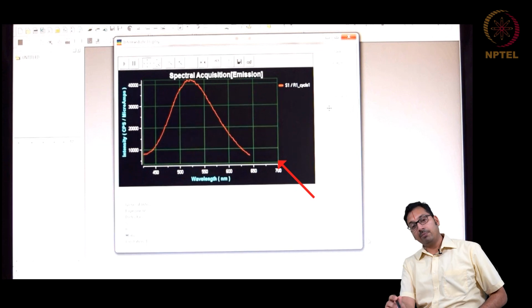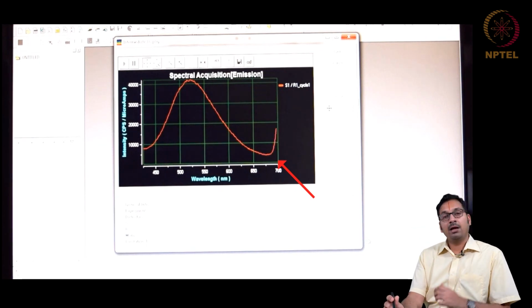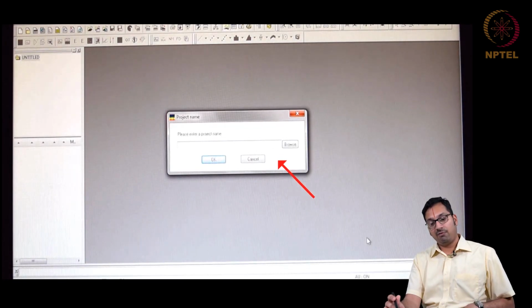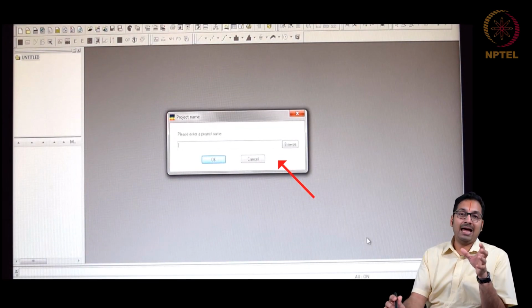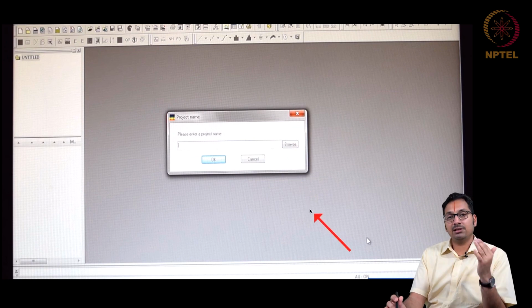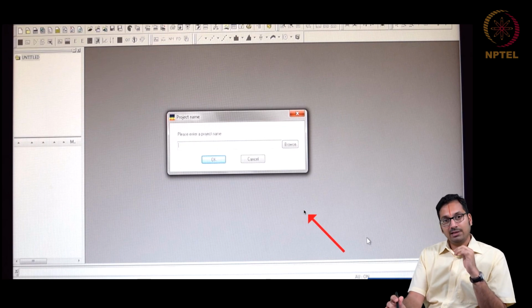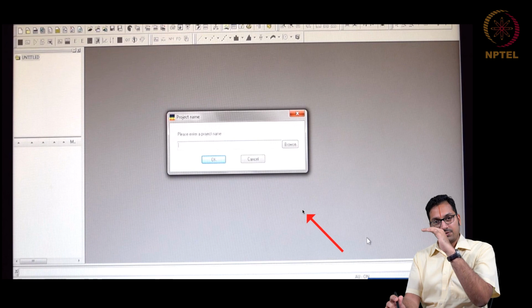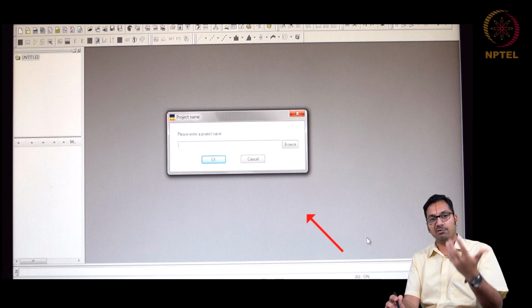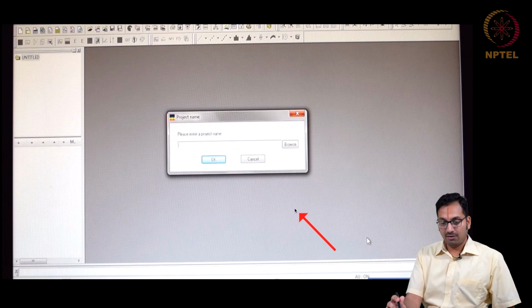If you might remember the last week's classes, what we ended up understanding there is that until the micelle is formed, you are not going to have the fluorescent dye that is trapped within this micelle, which will result in low fluorescence intensity. Basically the intensity maximum that you ended up seeing just a while back is going to be almost constant, but as the micelle is formed, this fluorescent dye gets entrapped within this and the fluorescent intensity will increase.